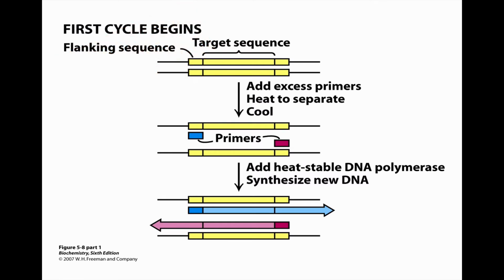So at the moment, PCR, or a version of PCR, is being used to detect the presence or absence of a virus in all these samples that are being taken from people. If the virus is present, we'll see the primers anneal to that viral sequence and we'll see an amplification event occur. Whereas if the virus is not present, those primers don't find their target region and no amplification occurs. So I'd advise you, as I said, to watch that video that I had prepared for the lab to give you an idea of PCR.